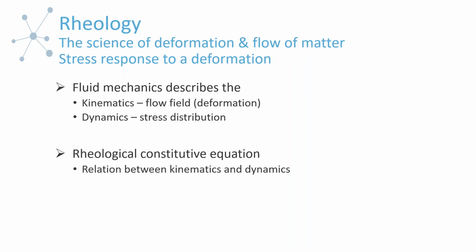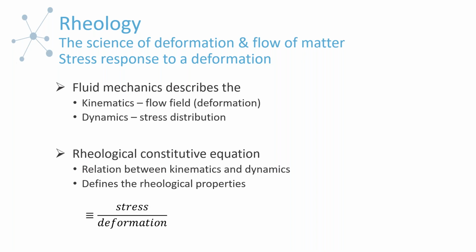Okay, so with that in mind, we need this constitutive relationship or equation to relate these two things that is relevant to us. And this is actually going to define what the rheological property is. So what you'll see is that this constitutive relationship is going to define a rheological property, which is going to be specific for a specific type of deformation, and then a specific type of stress response. So basically, different rheological properties are defined based on the type of deformation that you're imposing.